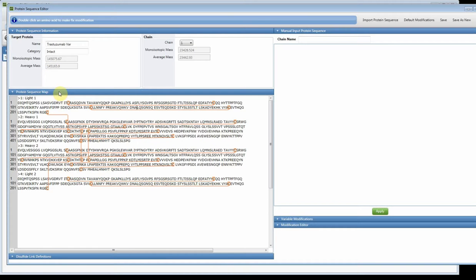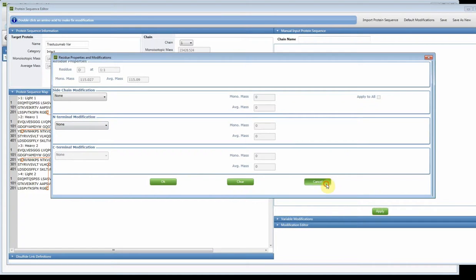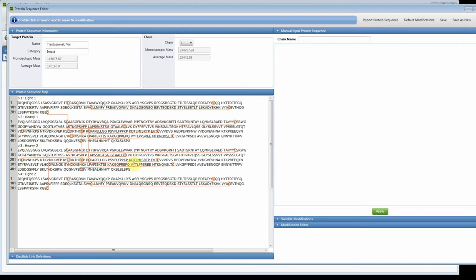This is not required for peptide mapping — you do not need four copies of the protein sequence, and you do not need to link the disulfide bonds. For peptide mapping, that is not required. Once we have everything linked, if I needed to add a modification to the termini, I could just double-click. In this example I don't, but if it was a Q for example, I could do the pyroglutamate modification by double-clicking on that residue. In this case, I don't have any static modifications in this sequence.